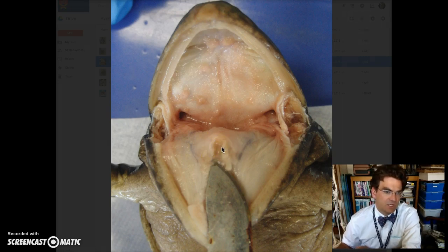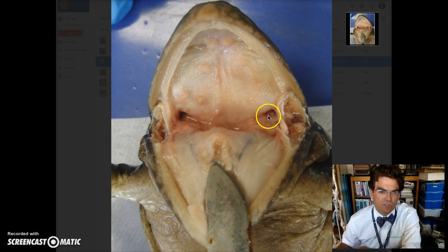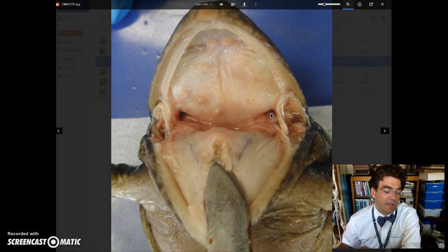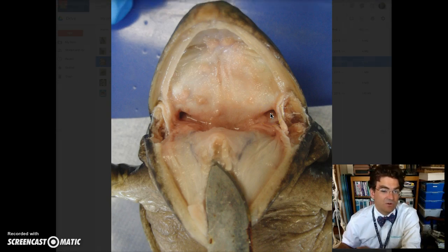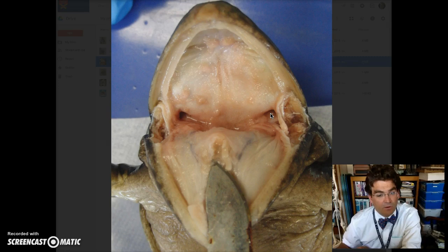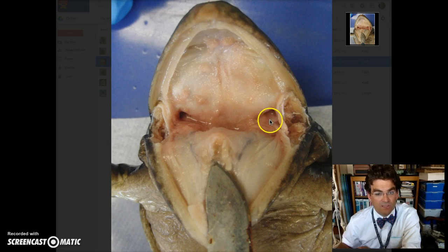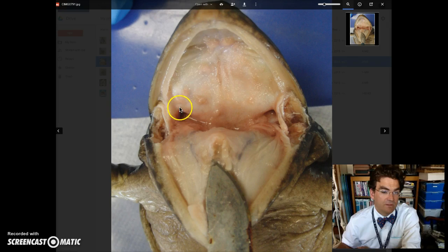The next is the eustachian tube. There are two of them — there's one right here and then one right there. Those eustachian tubes lead to the tympanic membrane, which is essentially the frog's eardrum. We also have our own eardrum and eustachian tubes that lead into our mouth, and so this is just kind of the frog's version of that. This is the entrance to the tube of the eustachian tube that leads to the tympanic membrane.